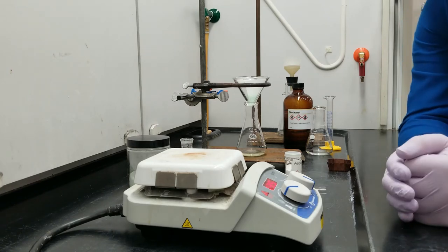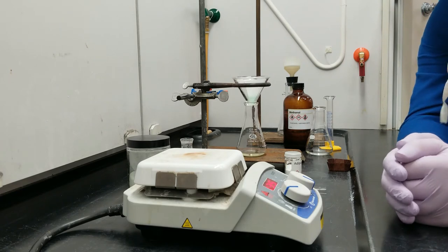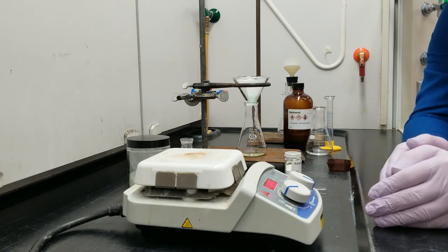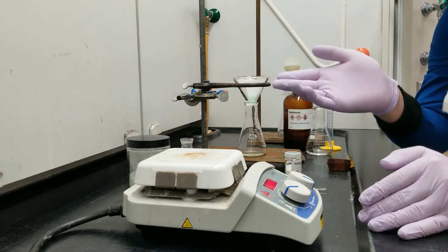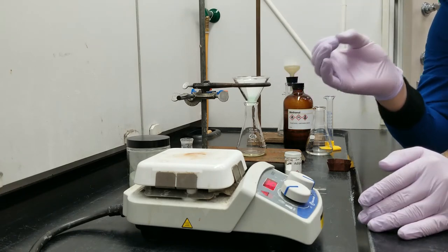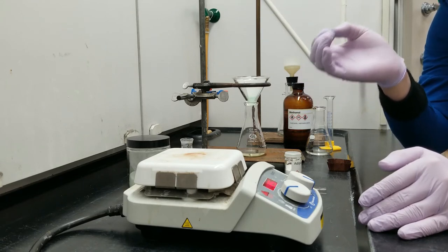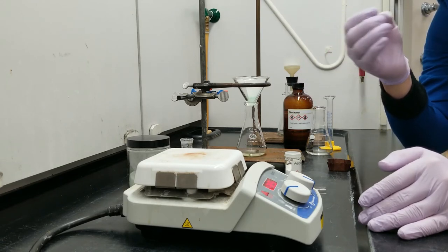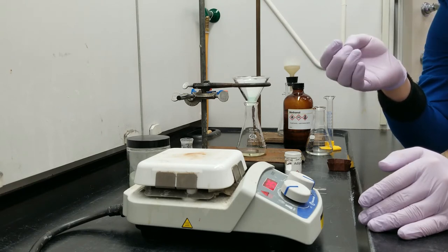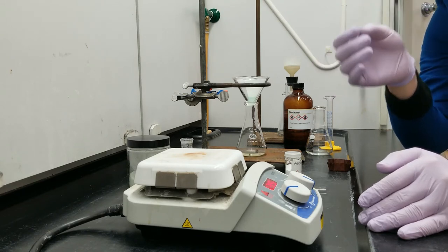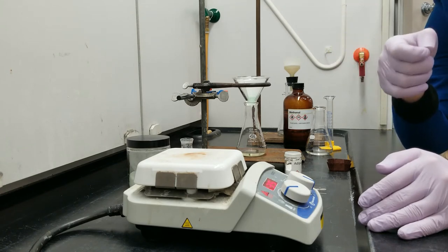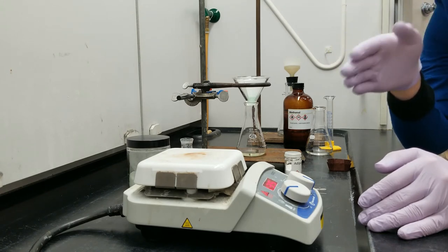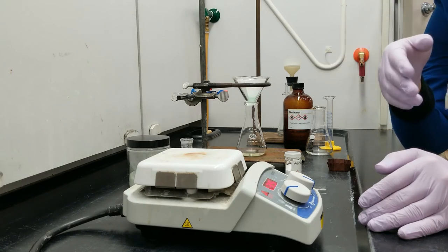I think that most people are going to be able to grasp how this filter paper can remove solid little bits of mass, like sand and mica. The trickier thing to remove, the trickier impurity is the benzophenone, because it has similar solubility to the adipic acid that we actually want to collect, and this is where recrystallization comes in.